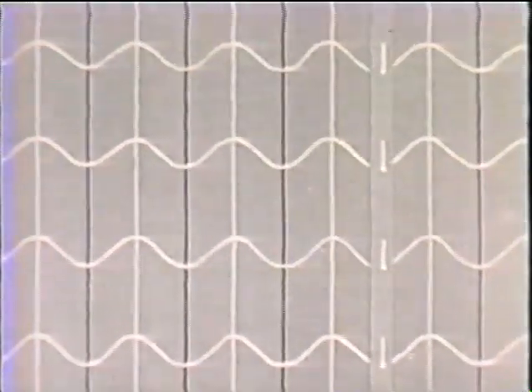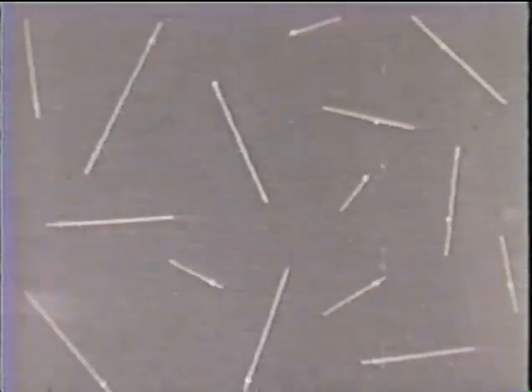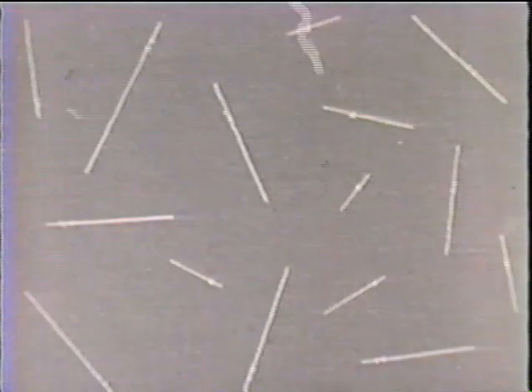A beam of ordinary light is composed of many such waves, which originate from all the points in the source. They are consequently vibrating in all possible planes.